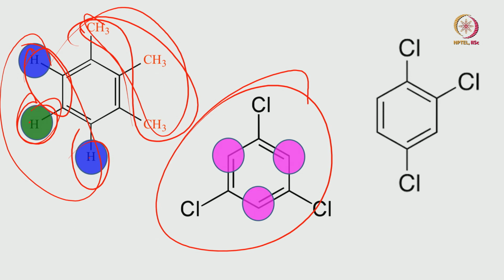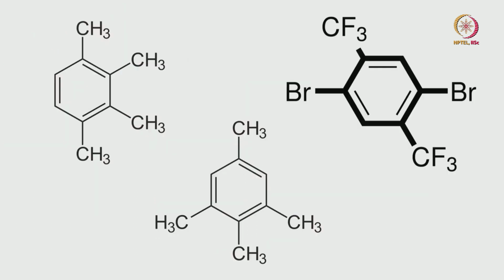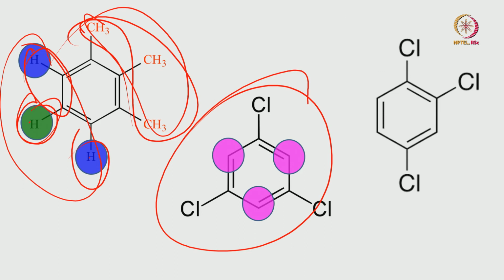So, what will happen if I take the proton NMR spectrum of 1,3,5-trichlorobenzene? You get only a single peak. There is another possibility: we can have a trisubstitution with a different substitution like this. There is no symmetry here, so as a consequence, we have different peaks.